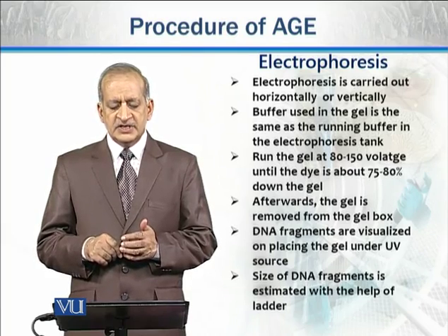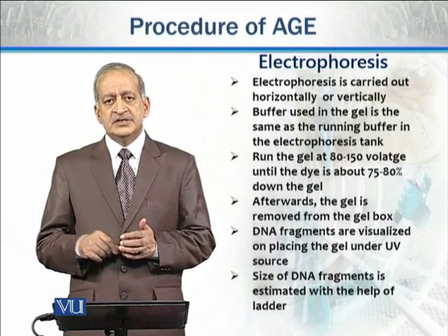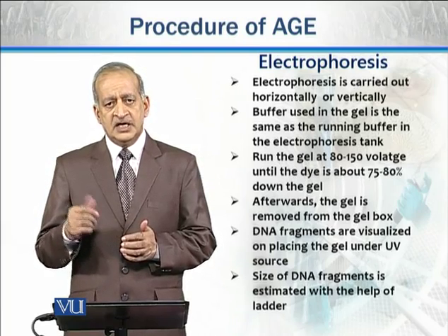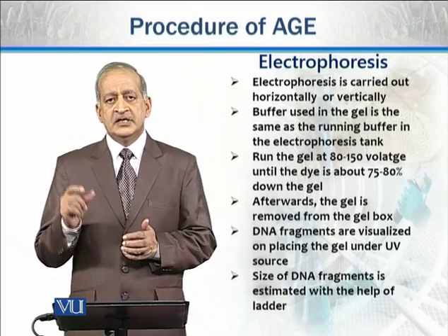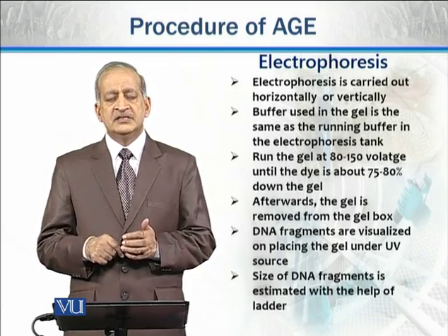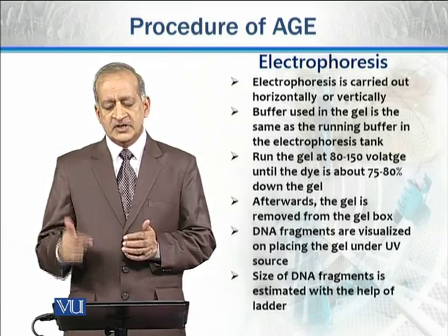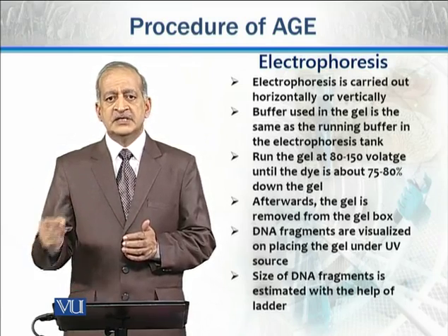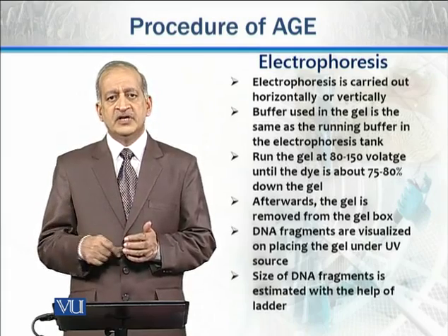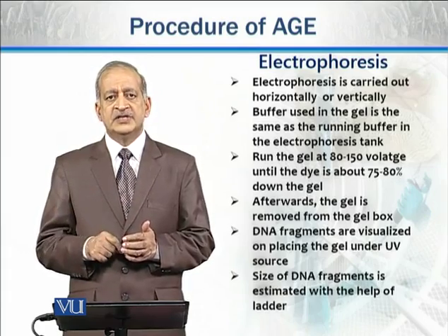Size of DNA fragments can be estimated with the help of DNA ladder. I have earlier discussed that in one of the wells, rather in the first well, normally DNA ladder is loaded and we compare our separated strands of DNA with the bands of ladder, and in this way we are able to estimate the size of the DNA bands.